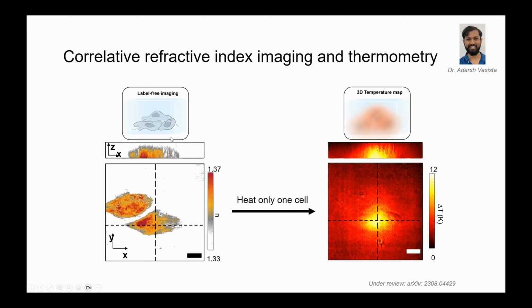Thank you for the talk. So I have two questions. First is, as I understand, the ODT method creates a barrier in terms of the refractive index gradient, which cannot be too large. So in that case, how large can it be in the methodology that you have developed?